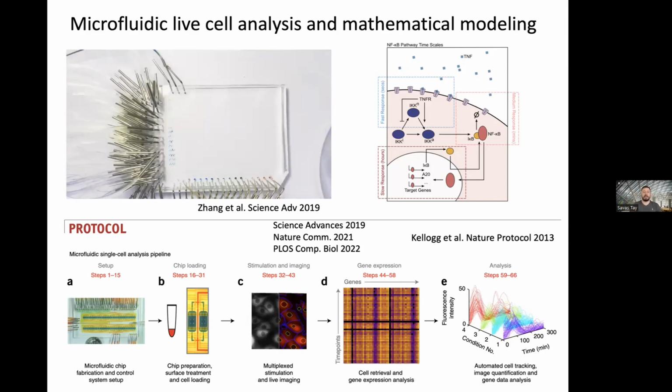So you can see that the device is completely automated. This is like your well plate experiments. Imagine that these are well plate experiments where you're loading different fluids into the wells and then monitoring what's happening to the cells that are being cultured. But this is extremely high throughput. You have thousands of conditions generated in this device, all simultaneously and in a fully automated manner. So we make these kinds of things. This is our research. It really enables performing high throughput experiments with live cells in a fully automated manner.